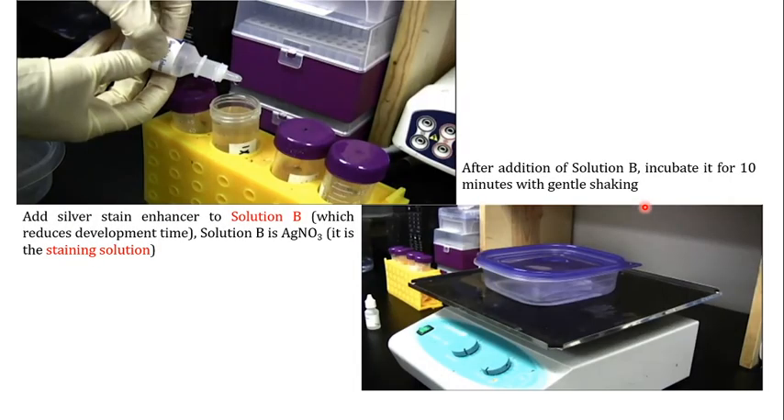Once Solution A has been removed, add Solution B to the gel. One important thing to keep in mind: in some cases you can also use the silver stain enhancer — add about four to five drops into approximately 150 ml of Solution B. The silver stain enhancer reduces the development time, so it is not necessary, but if you want to reduce development time you can add it. Solution B is the staining solution — the silver nitrate solution. Incubate the gel in Solution B for 10 minutes with gentle shaking.